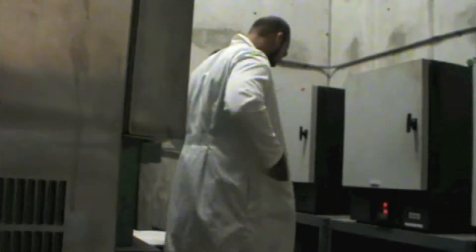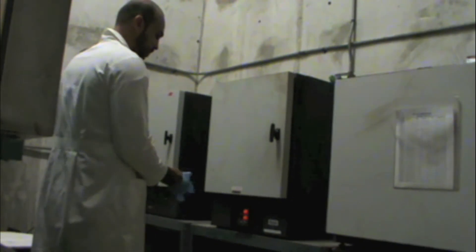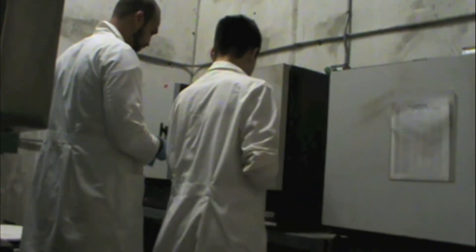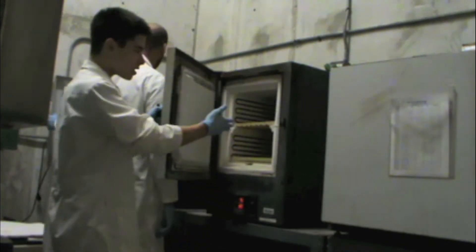Hold the door for me Martin. Thank you. Ok so we're here in the furnaces room. Let me just set the camera down on the tripod for a moment. Let's show the camera so you can see better.